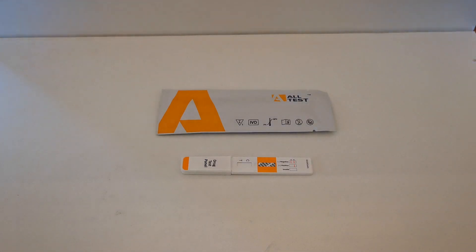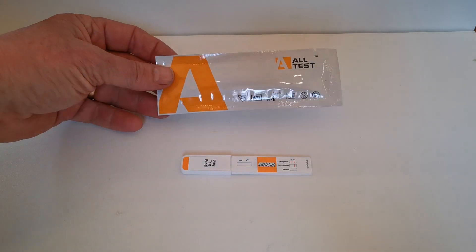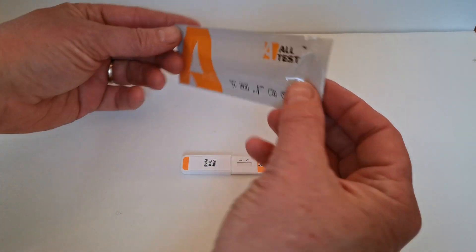Welcome to this UK drug testing and Valumed presentation for the new MDMA or ecstasy powder or surface wipe test. This is the standard foil that you'll be given when you order this test, all test branding.